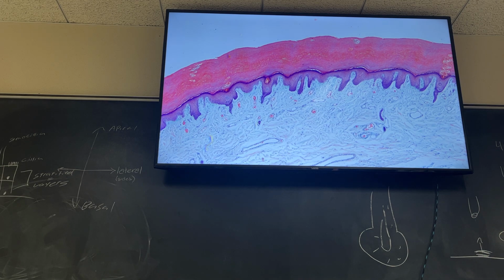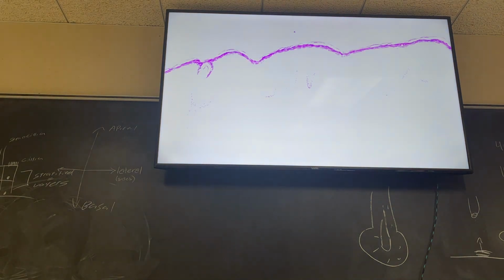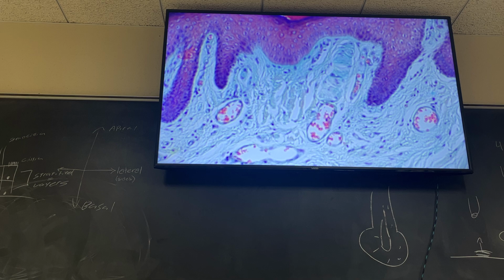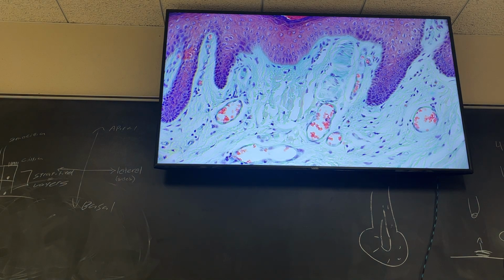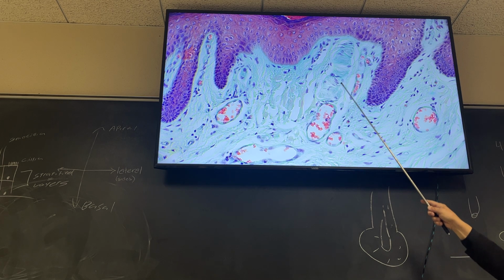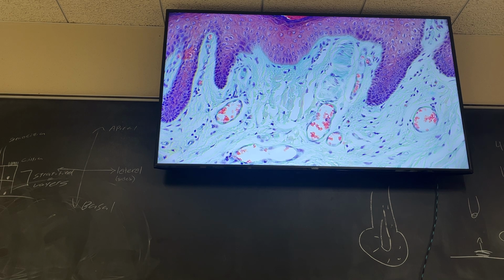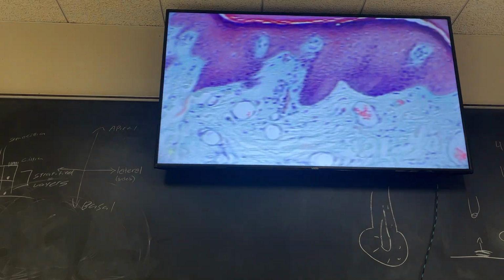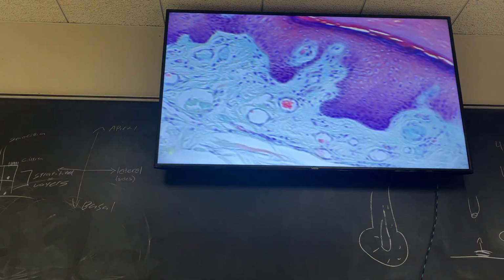Let me zoom in on that and show you a better view of it real quick. It's got a very distinctive look to it. There it is there. Everybody see it? Right here, right? Looks kind of like a stack of coins, kind of. Not really, but kind of. It's very distinctive though. It always looks like that. I'll find another one, I'll show you a different one at high mag as well. So I'll just look around until I find another one. Or maybe I should have you stop me when you see one. That would be more fun, wouldn't it?